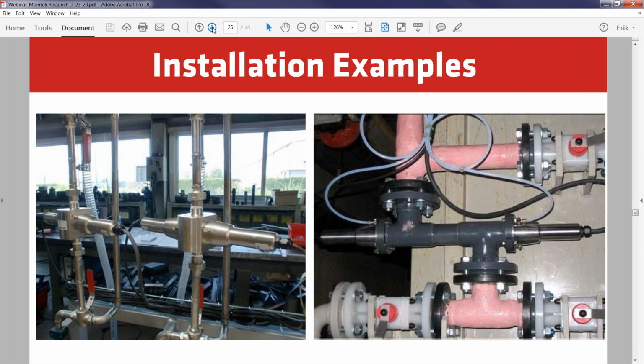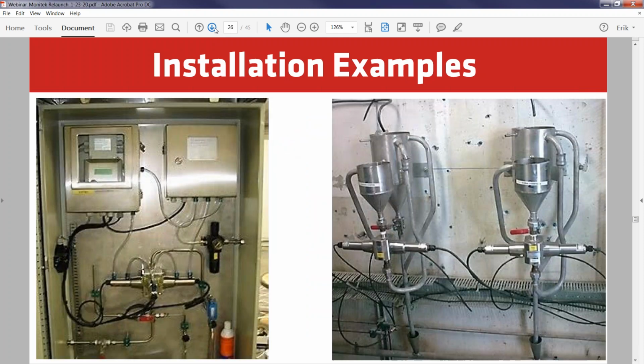That was for a very low color, and that's how we get sensitivity, by increasing the amount of sample we look at, right? Because of Beer's law. If the color intensity is constant, but we can't detect it, what can we do? We can concentrate that color artificially by increasing the optical path length between the sensor and detector.